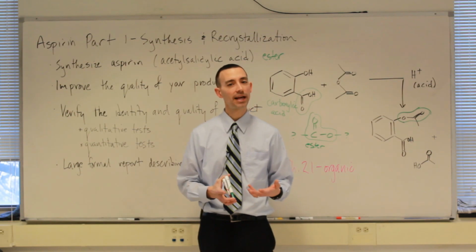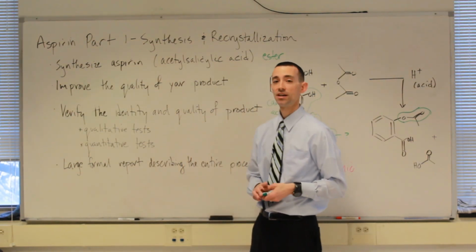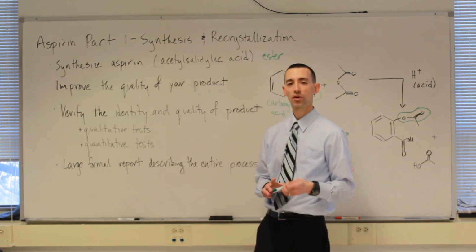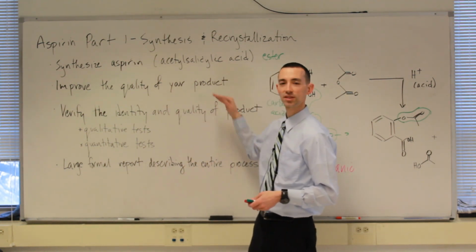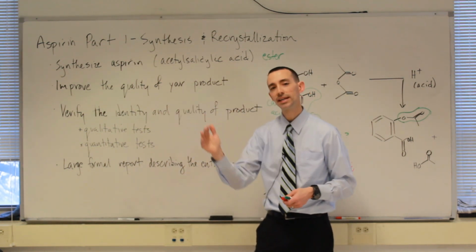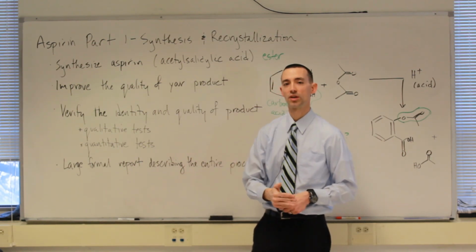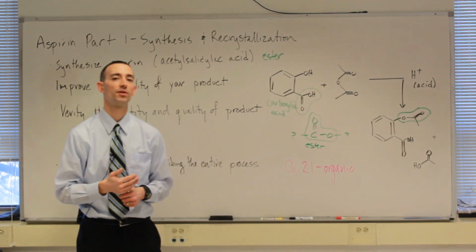The longer we allow the reaction to go at that right temperature of about 80 degrees Celsius, the more aspirin we're going to get and the higher the quality is going to be. The slower we let the recrystallization occur, cooling it down from the hot temperature down to the cooler temperature, the better the quality of our aspirin crystals are going to be.